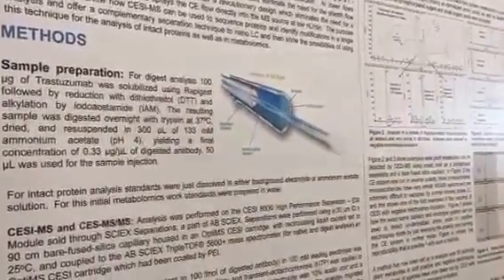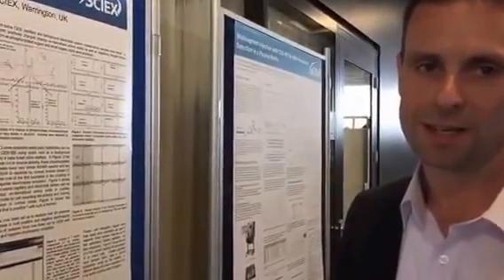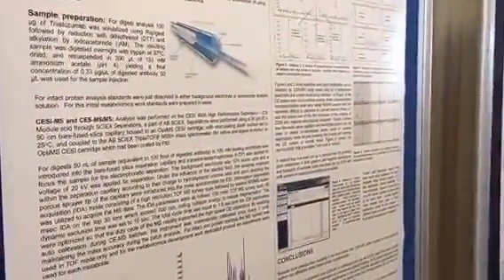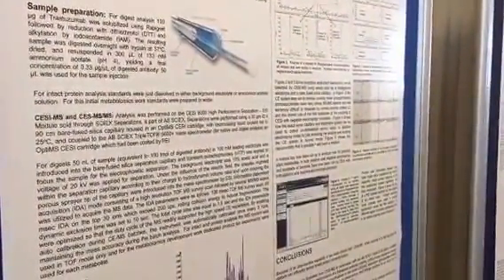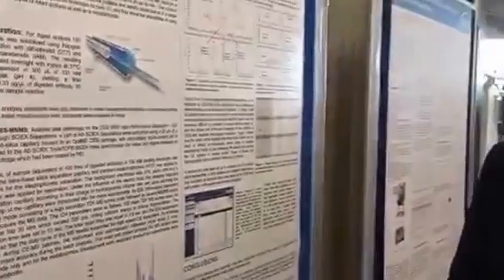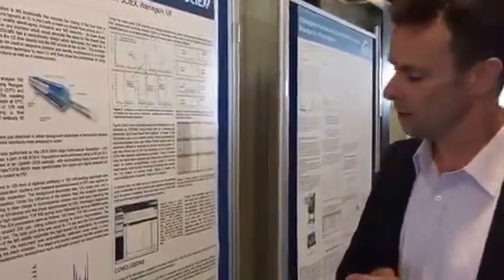Now the clever thing here is it's a sheathless setup, so that there is a very, very high resolution, ultra low flow rate on the separation, which then runs directly into the mass spectrometer. So this super low flow rate gives us exquisite sensitivity and minimal analyte competition. The example applications we give here are both in proteomics and in metabolomics.